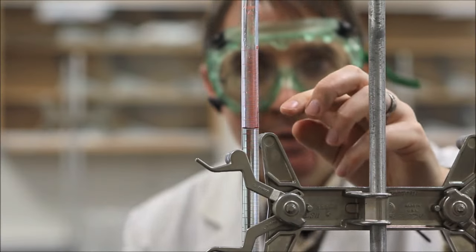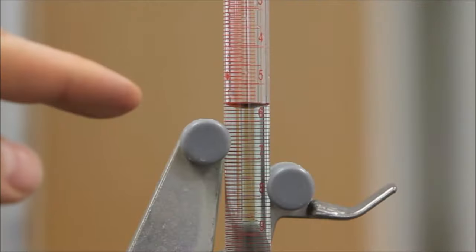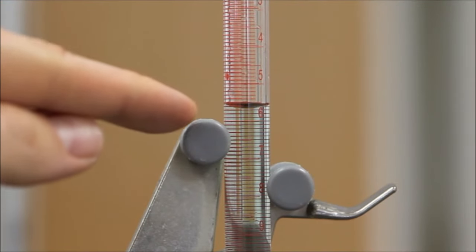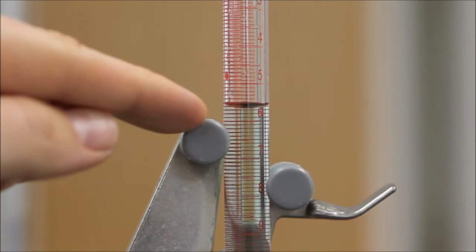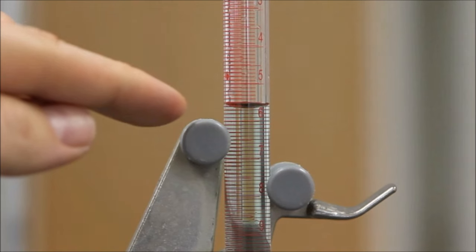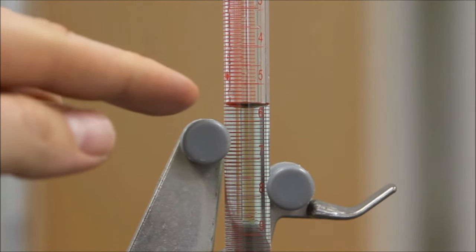We are now ready to read the initial volume of the burette. First, position yourself such that you are eye-level with the meniscus to avoid parallax error. We see that the meniscus is between 5 and 6 milliliters. Further, it is between 5.6 and 5.7 milliliter marks, and finally, estimating to the hundredths place, I record the initial volume as 5.67 milliliters.